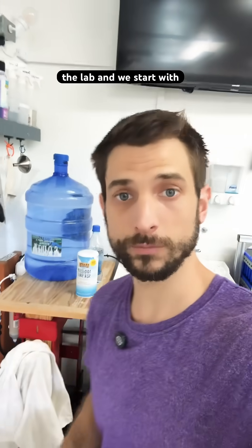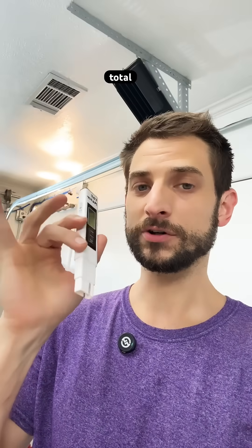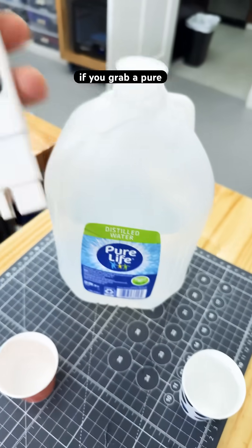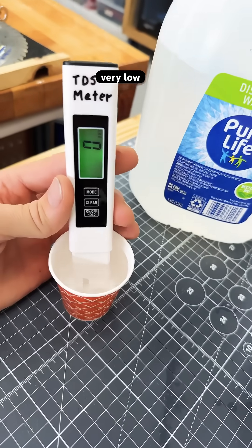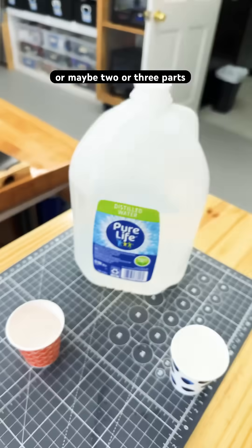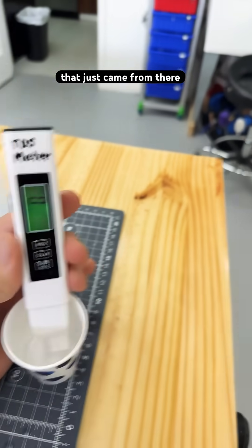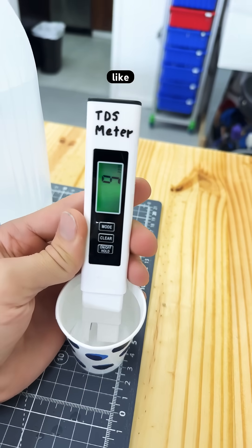We make our own water for the lab and we start with the reverse osmosis water. This meter is precious for checking total dissolved solids. If you grab pure water then you're going to get a very low reading, zero or maybe two or three parts per million. And then we can measure the reverse osmosis water that just came from there and we're going to get a low reading like nine.